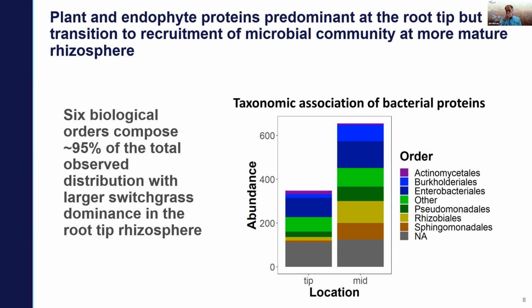Yes. Yep. Exactly. And I will caution. There's one caution here, in that, as we saw with some of the later data, this really spatially resolved, non-destructive approach does get a little bit less protein coverage in the results. So fewer numbers. So I don't know if we'd want to construct interaction networks or things like that necessarily. Just the one caveat of the data. Yeah, but this is really wonderful.